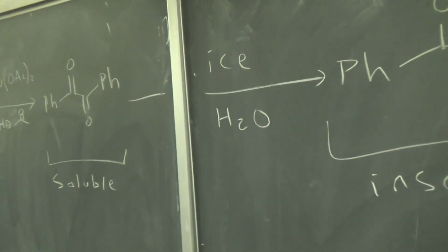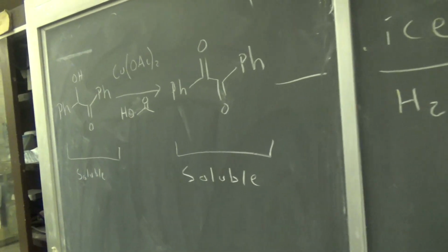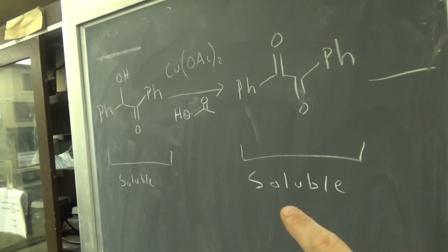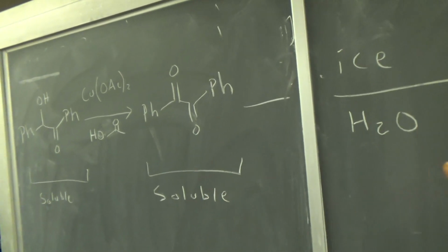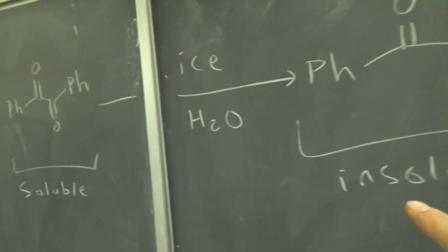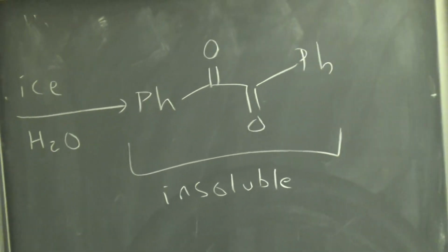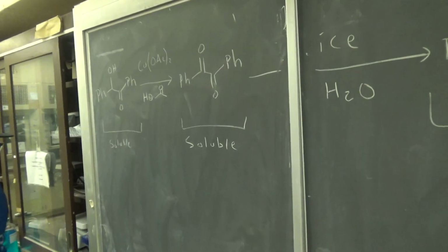That's a really cool trick that we use often. Carry out a reaction in a solvent, add water, and if the water dissolves in that same solvent, like water dissolves in acetic acid, then you get the product out. Just a really cool little trick, and we just wanted to point that out. So anyway.